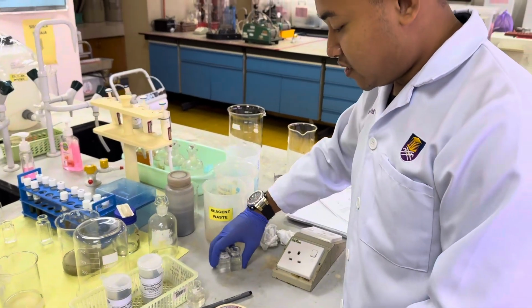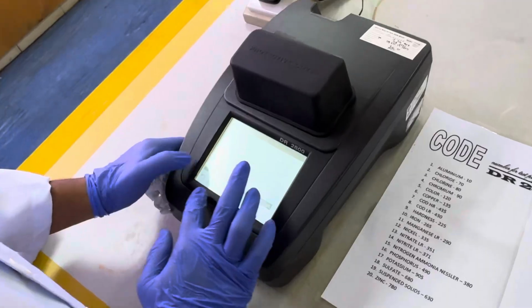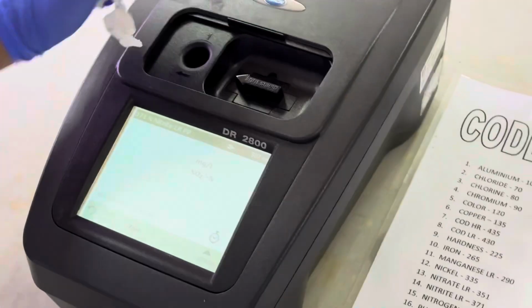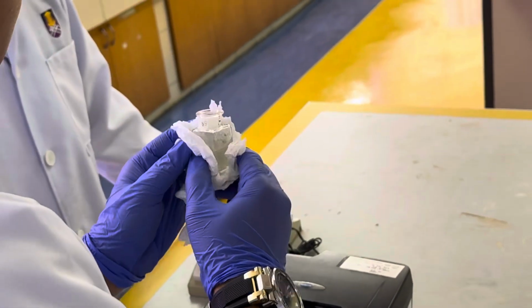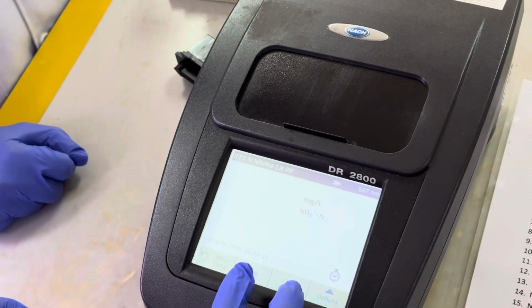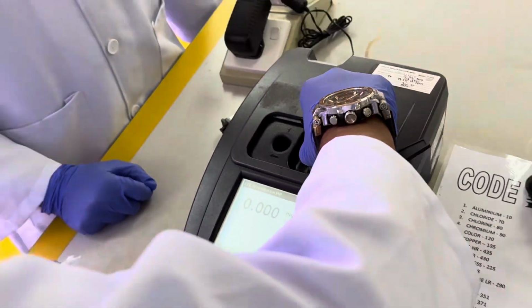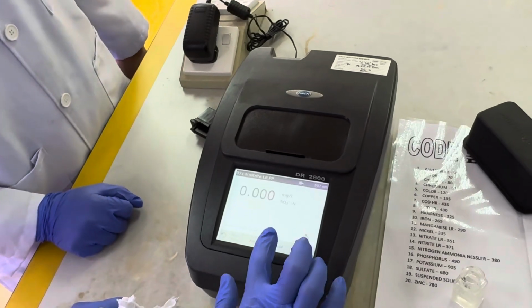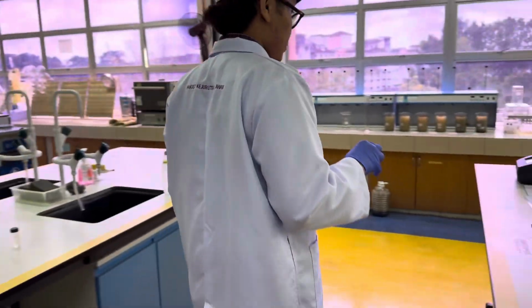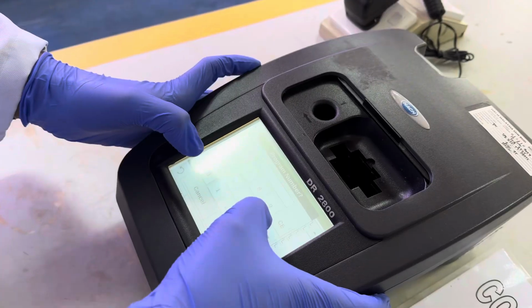In the meantime, the nitrite sample is ready to be tested. First, you have to enter the program number for the nitrite testing. And then, you have to wipe the sample cell cleanly using a tissue to avoid any fingerprints. And then insert the sample cell into the spectrophotometer. This is the blank result. And then you take out the blank and then repeat the same step for the sample cell. When nitrite is done testing, you can test for the nitrate test. Repeat the same step as before.